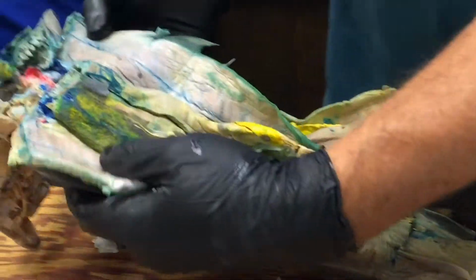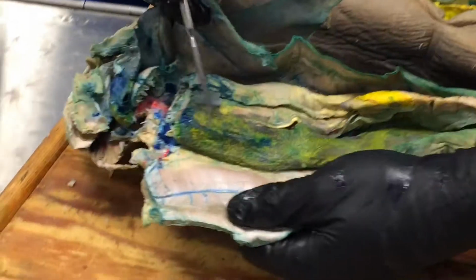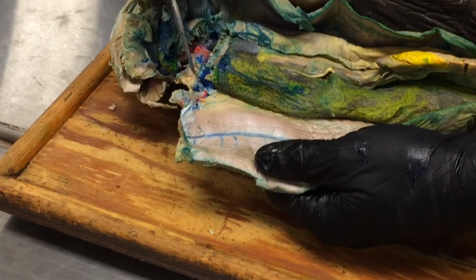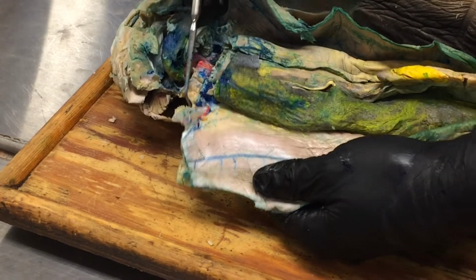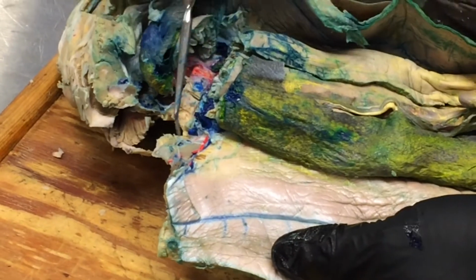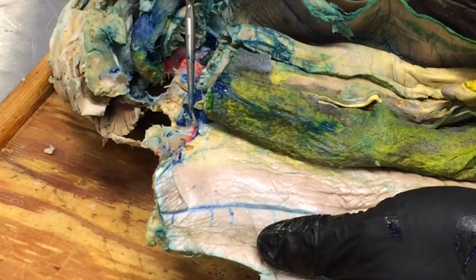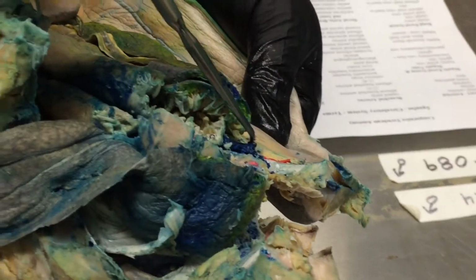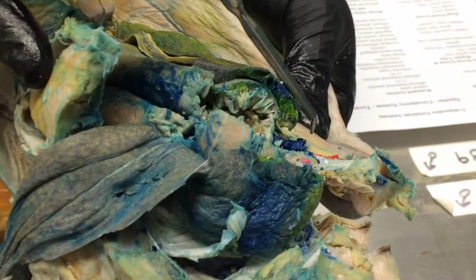Yeah. The lateral abdominal veins come along and they kind of wrap around and turn into something called the subclavian vein that then drains down into the common cardinal. Oh, wow. And you can see that right here, the subclavian coming in to the common cardinal. You see that? There's lateral abdominal, and it wraps around there and then comes in here as the subclavian vein.